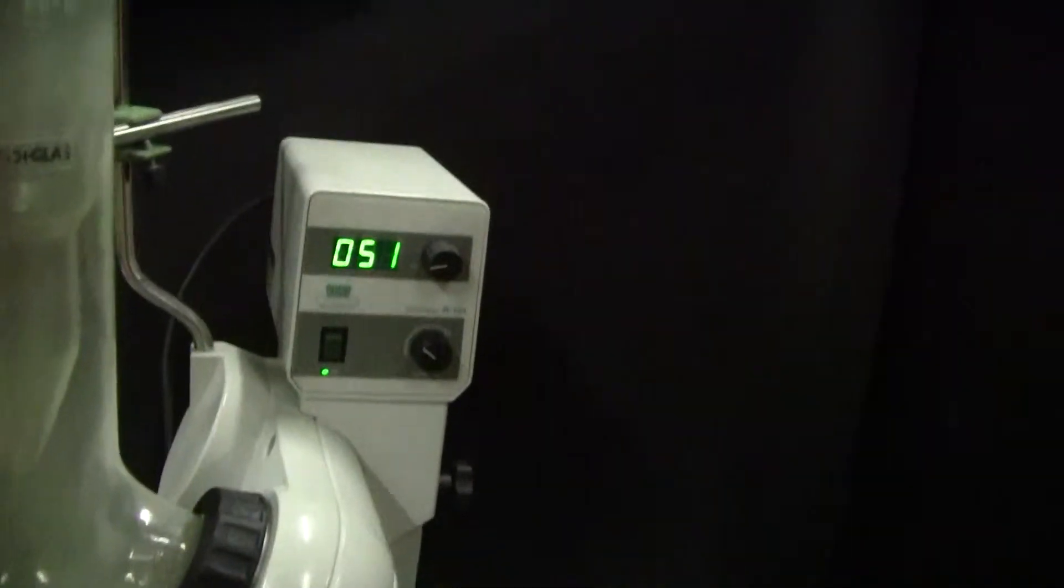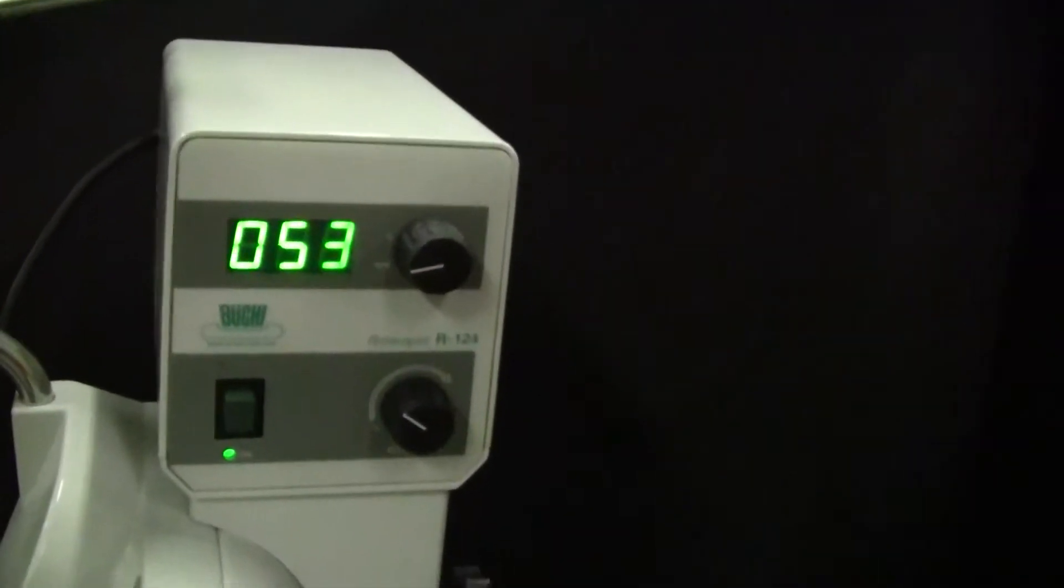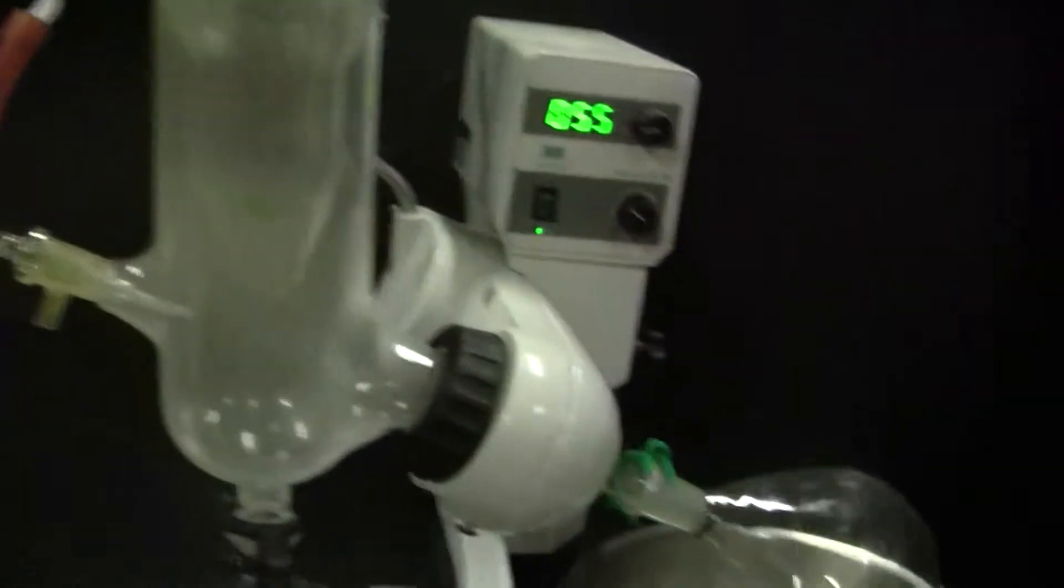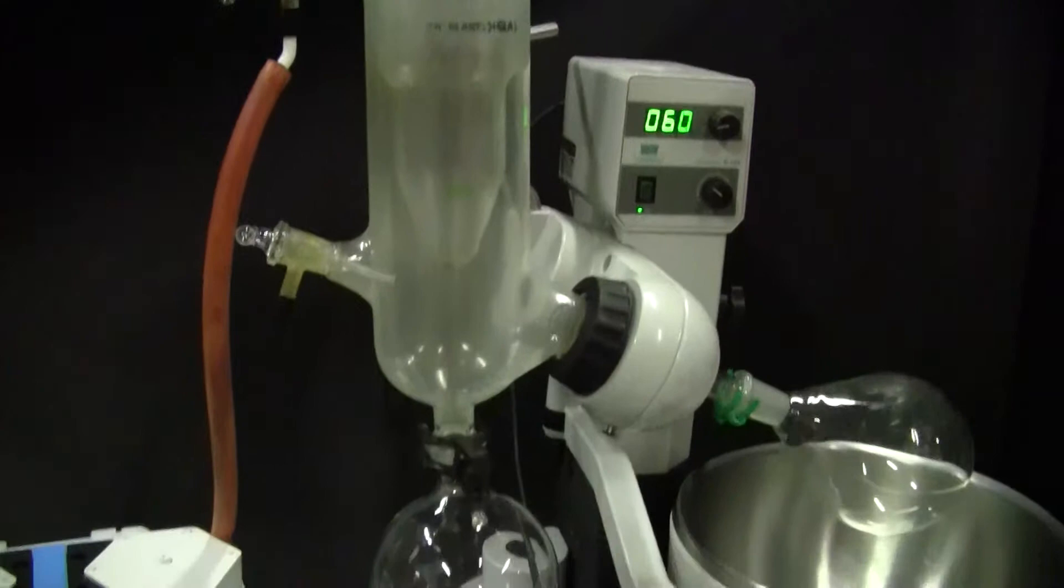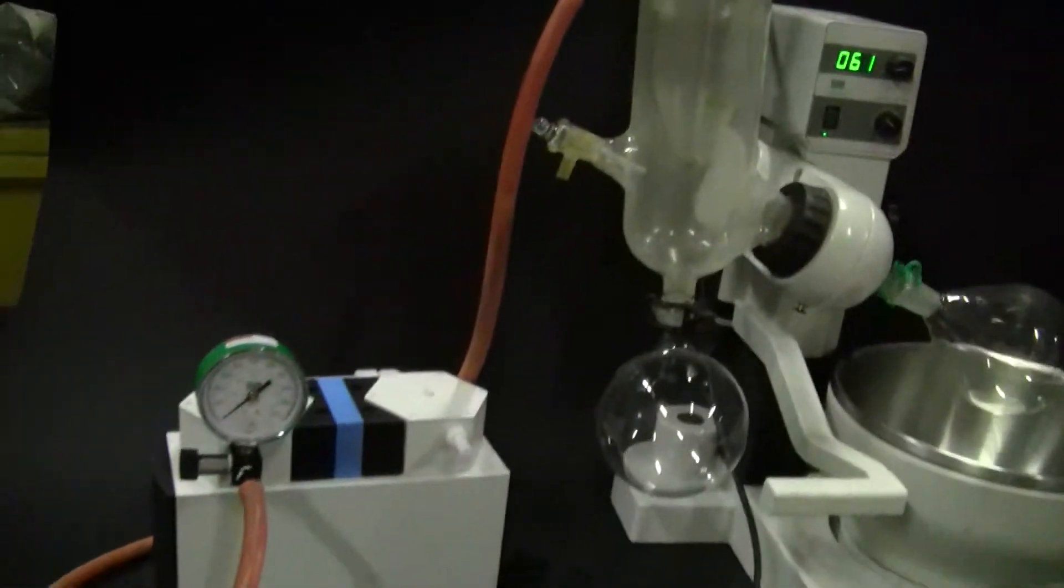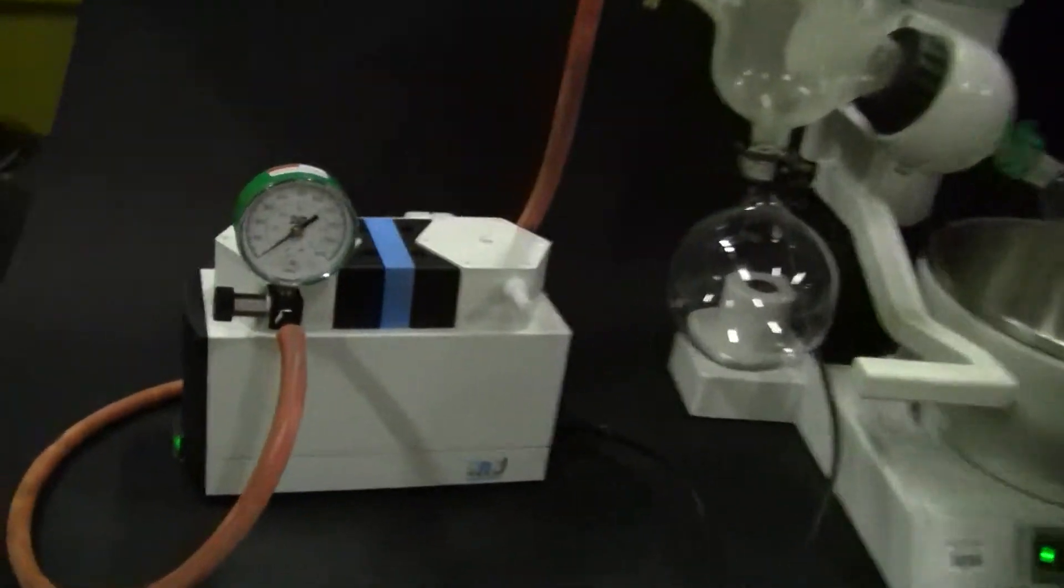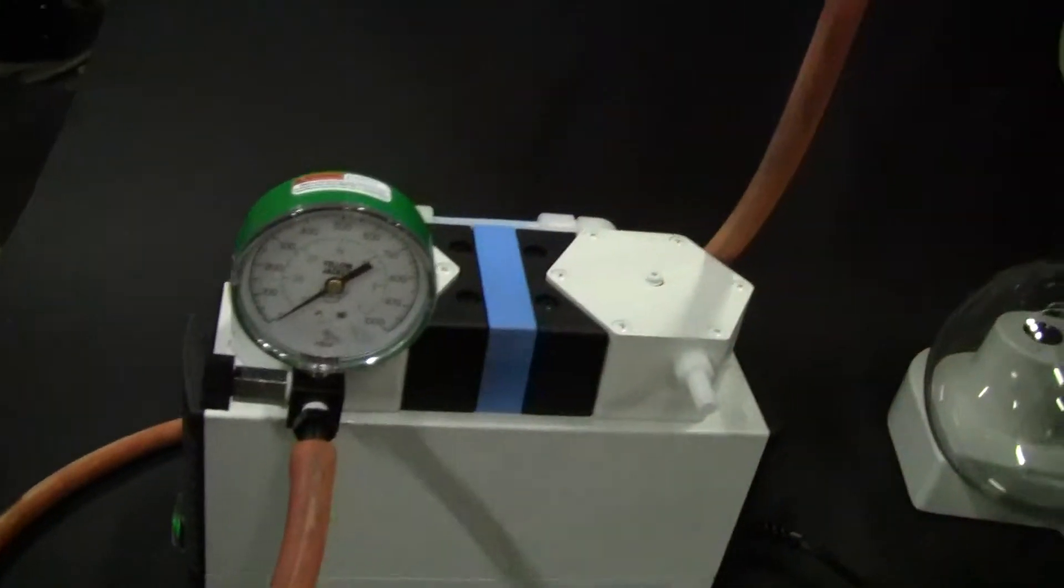With a R124 head, it's a 1 liter system. It has a cold trap condenser on it, and in combination with that is the KNF vacuum pump with our gauge package.